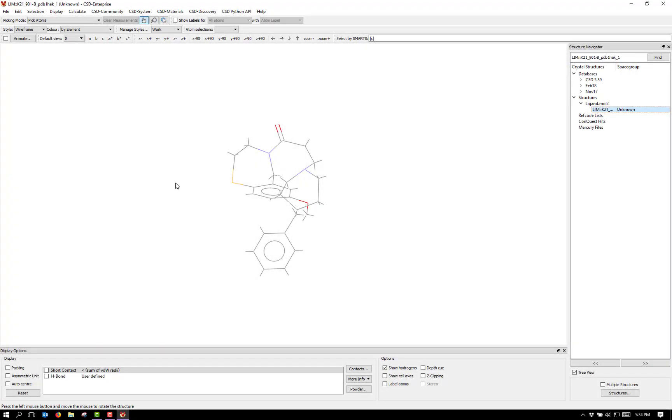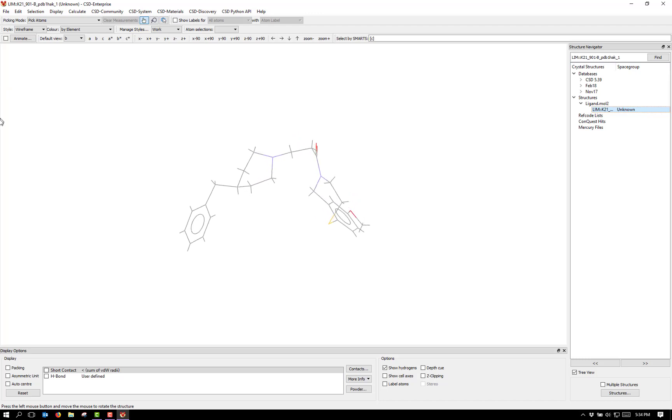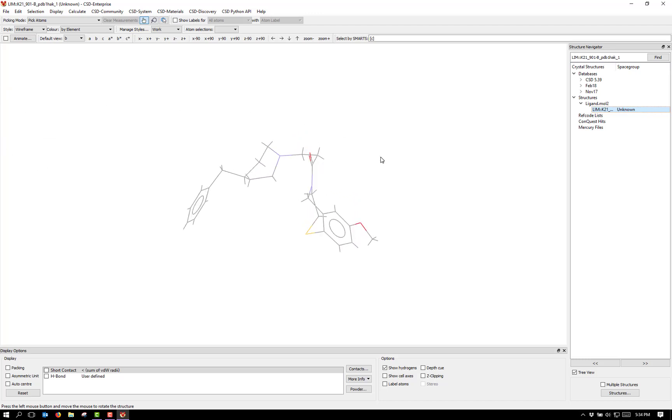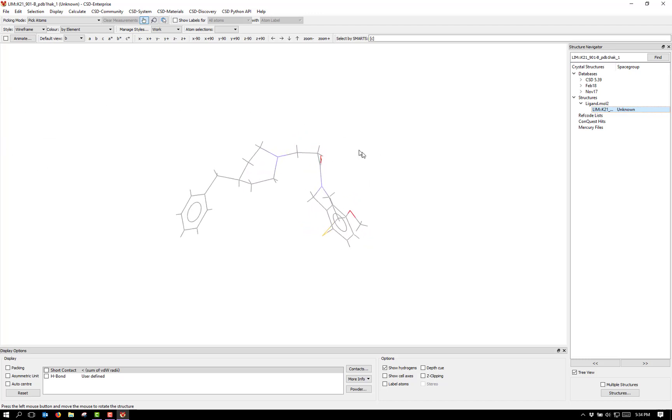Here I have the coordinates of a ligand molecule from a protein crystal structure determination. As you can see, this is quite a complex molecule. We'd like to make sure the chemistry is reasonable based on similar structures that are in the CSD.